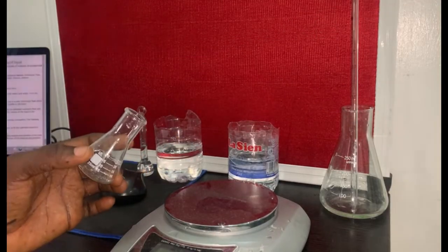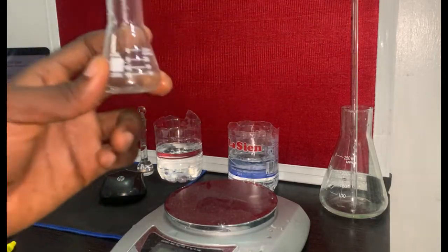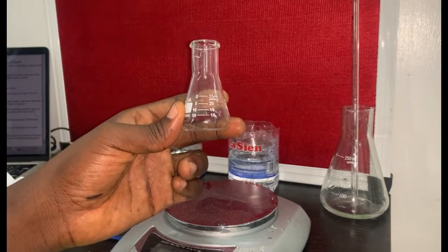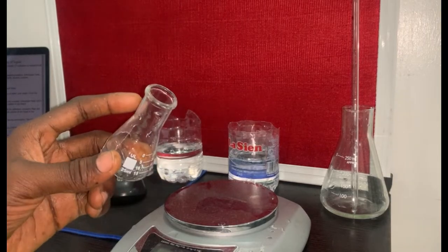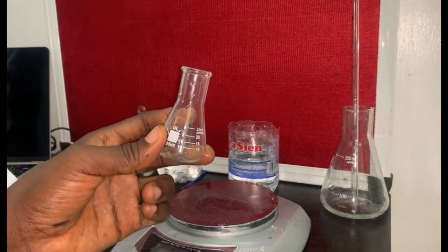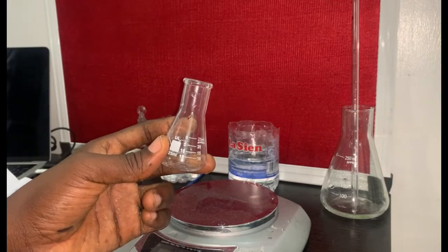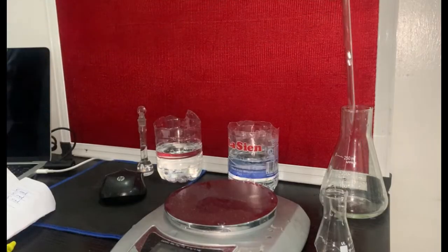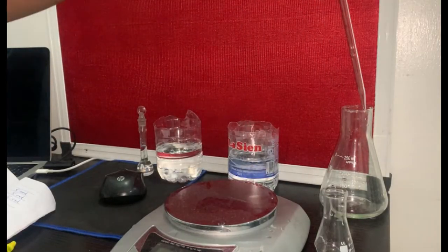So if I want to know the mass of the water this pipette delivered, I'll say 26.52, which is the mass of this flask when it is filled with 5 ml of this, minus the mass of this when it is empty, which is 21.52. That will give us 5 grams. So it simply means that the mass of water delivered by one of this is 5 grams.